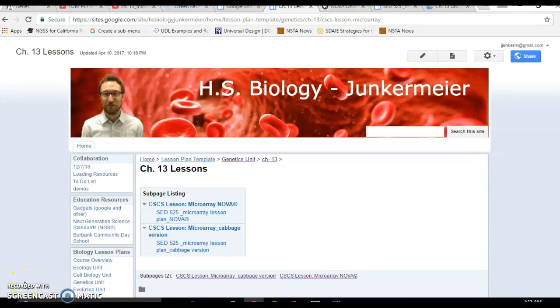This is a support video for students or teachers alike engaging or interested in the microarray lesson. Now, this microarray lesson was previously described in the Nova version, so I recommend that if you haven't been introduced to this lesson yet, go to the link right here, the microarray lesson plan, the Nova, which holds more truly and more precisely to the procedures of the microarray lesson.